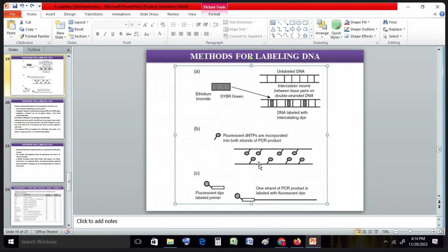Like if you don't have those specific primers, then you also have to think about how to go through with your process. It's not research. It's kind of like a diagnostic process. Everything is ready made. But as you're a researcher, you should know everything. Yes, sir.